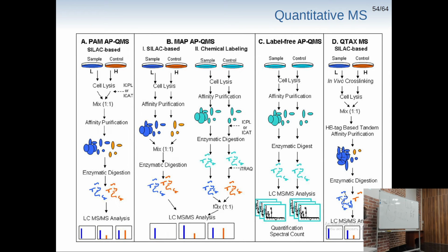Can we compare just the count of ions in the first sample and in the second sample and say that there is a difference between them, this one is bigger, this one is lower? If not, what can be the causes of these differences, which are not the actual sample but something else?